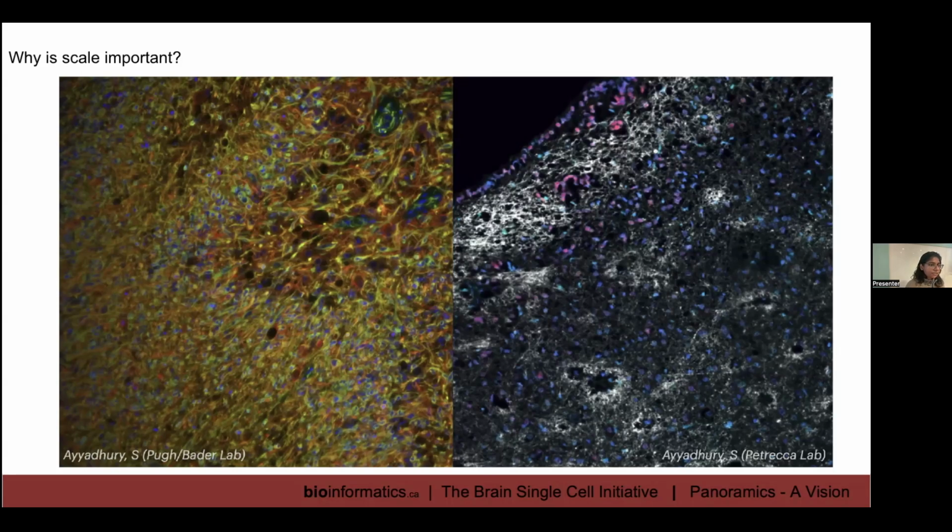But scale becomes important because it will determine the distance or the resolution. If your scale is small, 2 micron, for sure you can understand what is subcellular. You can identify your single cells. But we change the scale when it comes to Banksy.